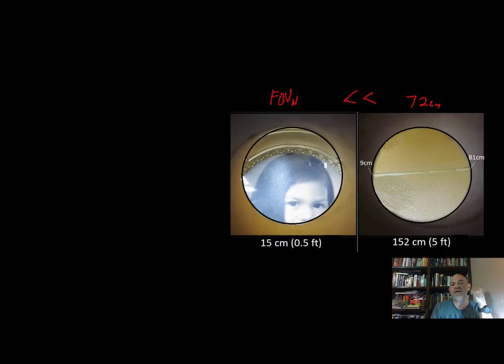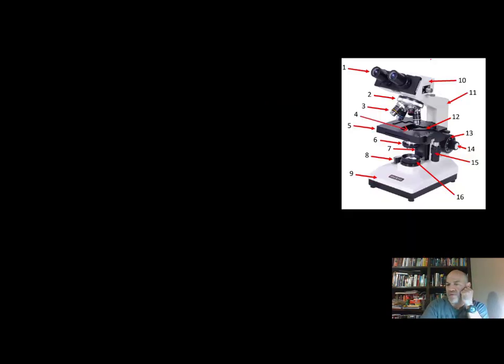It turns out there's a relationship between how close you are, or in other words, how much you've magnified or zoomed in, and the diameter of the field of view when you compare it to your field of view of the original one. And so we're going to be looking at that.